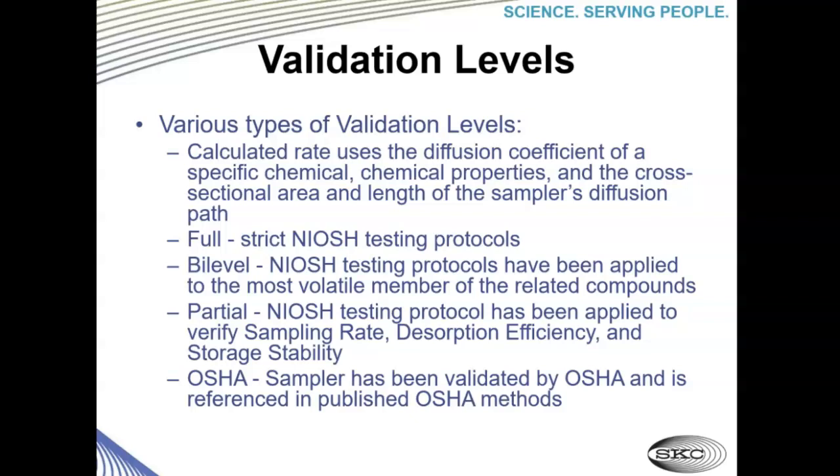A full validation is going to undergo strict NIOSH testing protocols. These could include storage stability studies, reverse diffusion, how that badge is going to operate under different temperatures and humidities, and there's a lot of other testing involved in that.